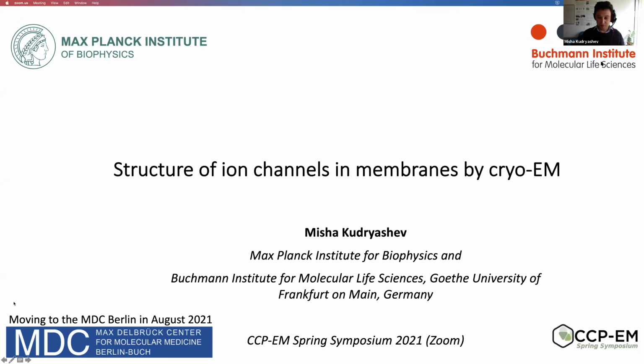Great. So I'll be talking about some recent work, and I will get a little bit technical, but this is all just to share how we try to look at structures of membrane proteins in membranes, mostly by cryo-EM, with a focus on ion channels.